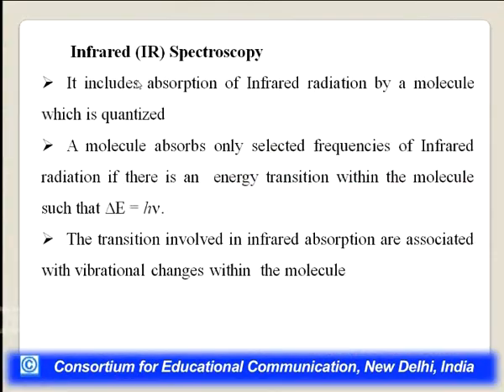What is IR spectroscopy? As we talked about, what is spectroscopy? Nothing but interaction of electromagnetic radiations. If we take infrared radiations, then it will be infrared spectroscopy. It includes absorption of infrared radiation by a molecule, which is quantized. That is, delta E equals h nu.